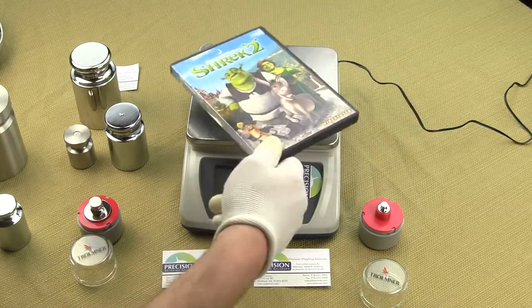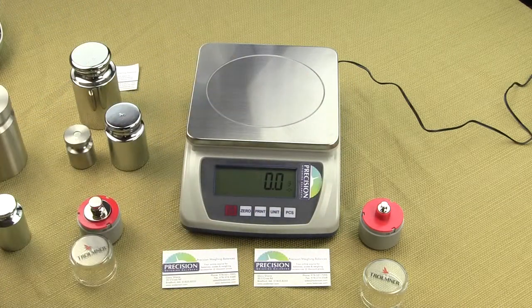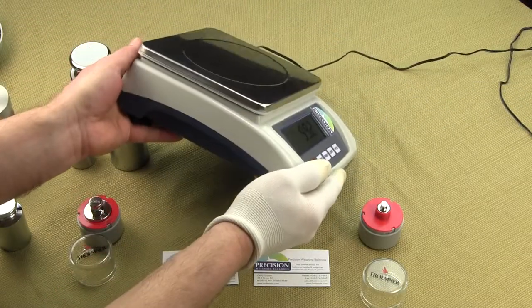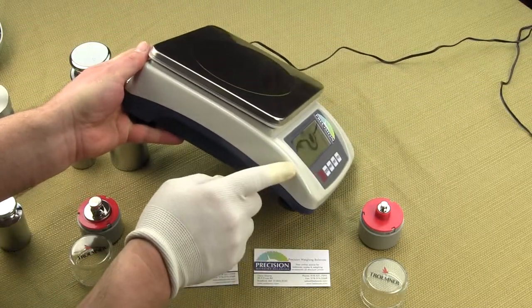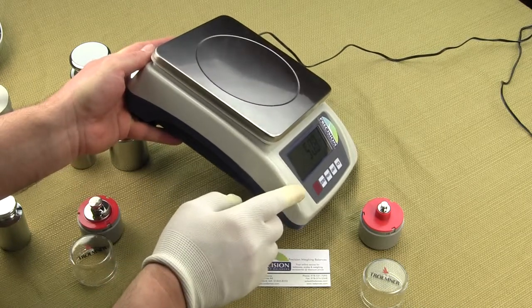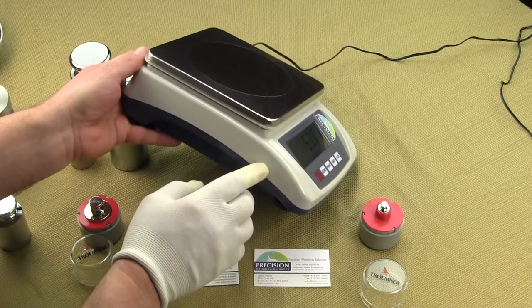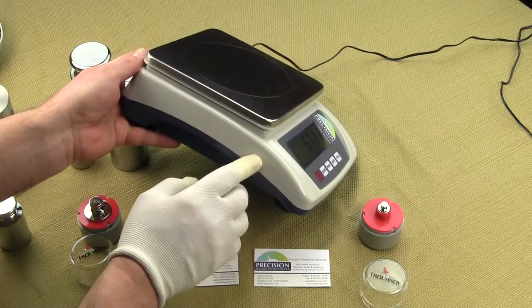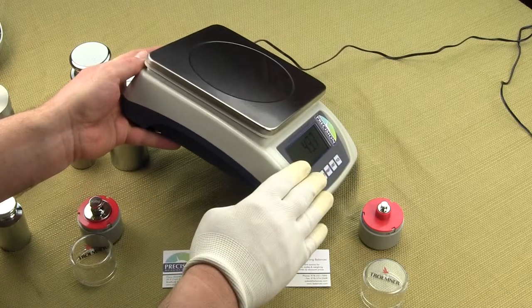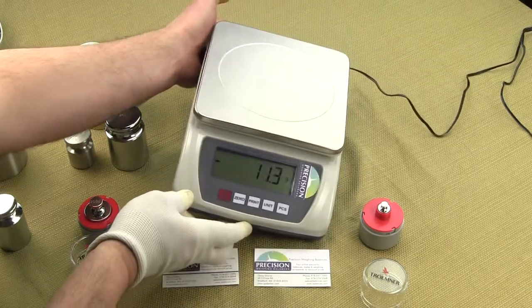If you do have a large object that extends over the platform, you'll notice that the display is on about a 40-degree angle. So if you do have large objects, you'll still be able to see that display. Most comparable scales in this category — if you look at an Ohaus Scout or an A&D EJ or EK series — the LCD is in the same plane, so if it's a large object, it would cover the display altogether.